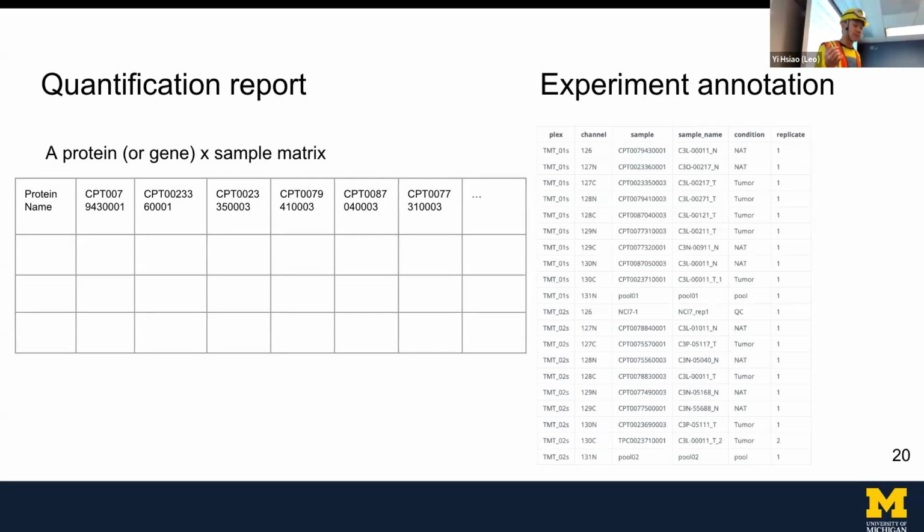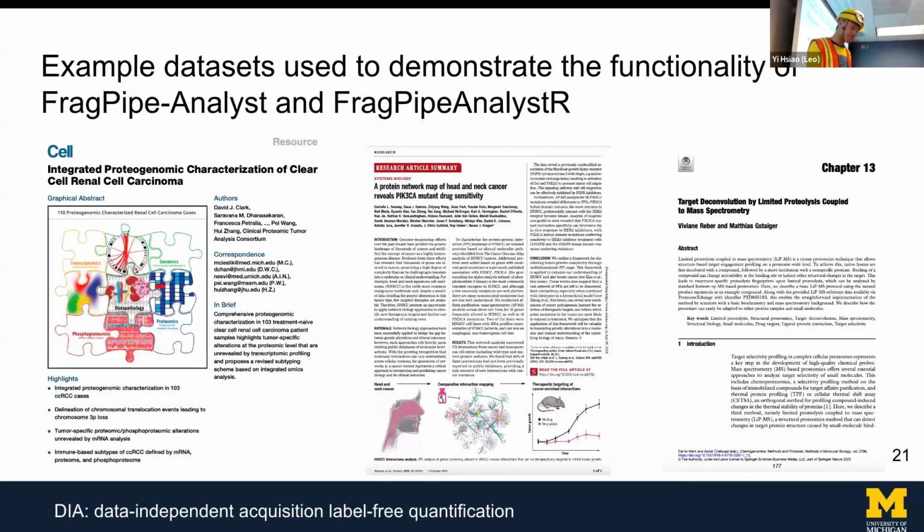Some people will have replicates in the cohort, but in this example I didn't have many replicates, only one here. But generally, this is another column. When you do a visualization, you want the user to switch back and forth to see if they have batch effect across the replicates.